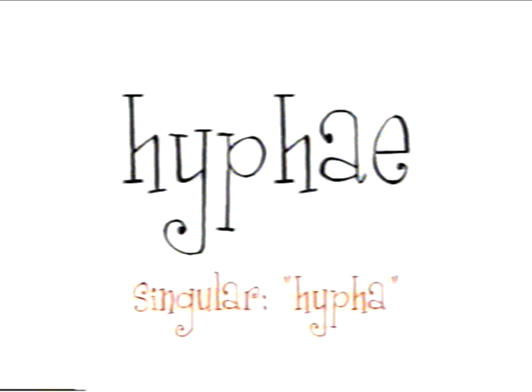Under our microscope, we can see the stem-like hyphae of this mold fungus. These tiny threads are usually made up of many, many cells. Each mold fungus hypha grows into and through more and more bread until the mold has used up most of the carbon compounds or food that it comes in contact with.